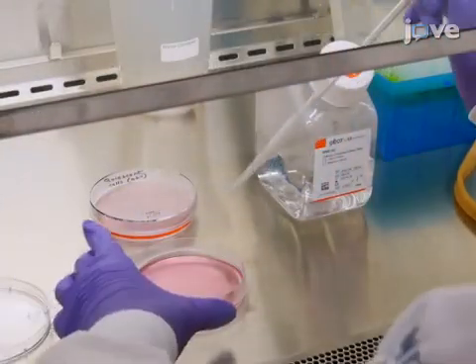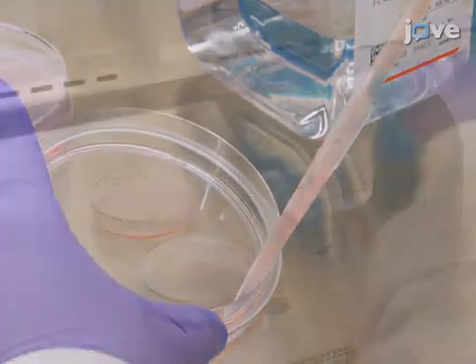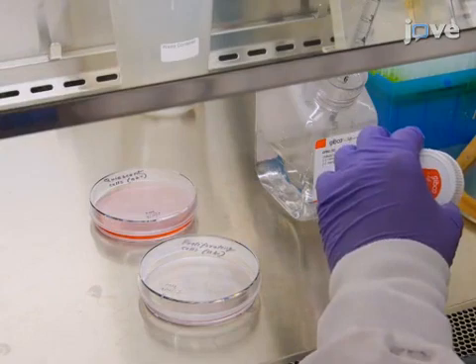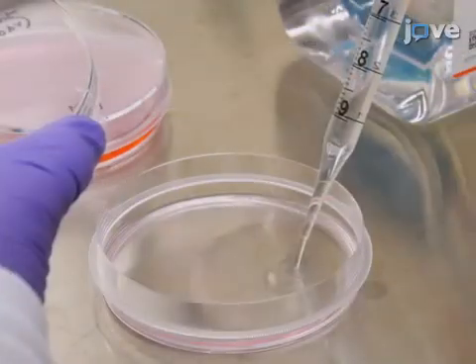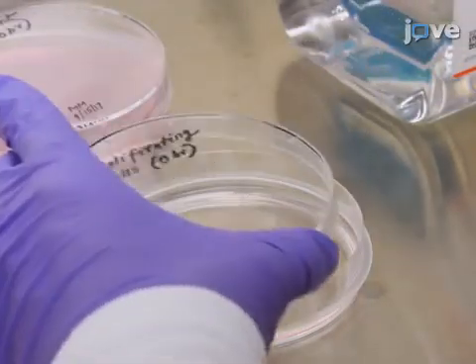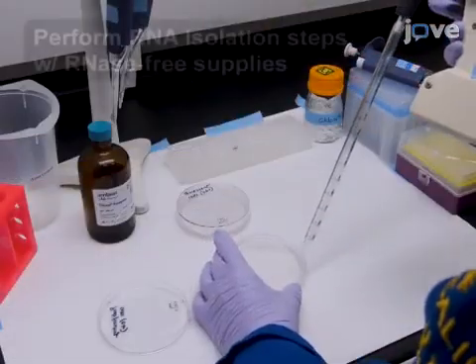To collect the 0 time point sample, gently aspirate off the ACT-D medium and pipette between 5 and 10 milliliters of pre-warmed PBS onto a 100 millimeter plate: 5 milliliters of solution for a 100 millimeter plate, 2 milliliters for a well of a 6-well plate, and 1 milliliter for a well of a 12-well plate. Gently aspirate the PBS.